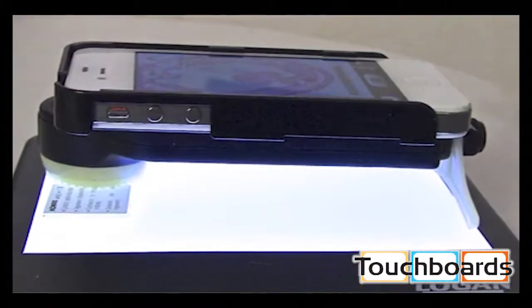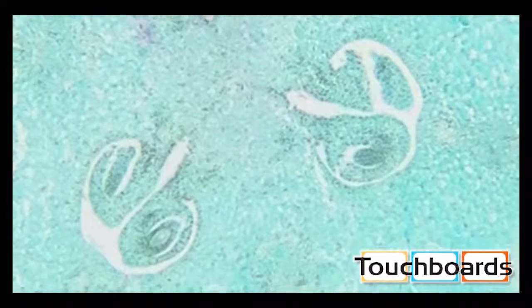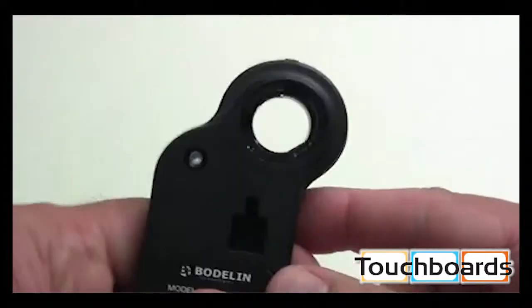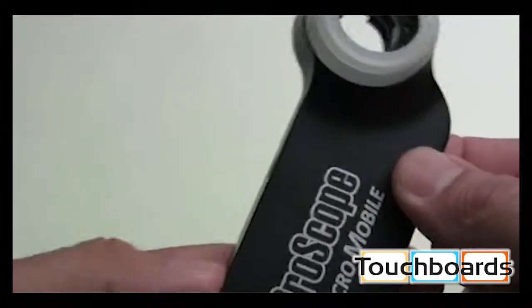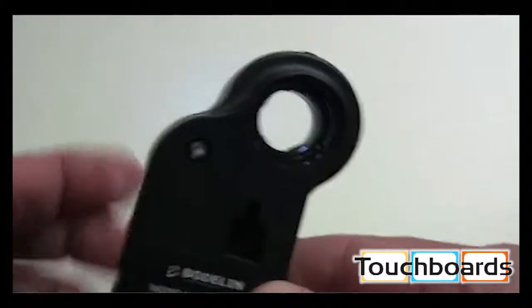You can also have the power off and use a backlit source to view slides and translucent subjects and materials. You can also remove our ProScope MicroMobile lens and just use the iOS camera lens with our ring of LEDs for direct illumination without magnification.